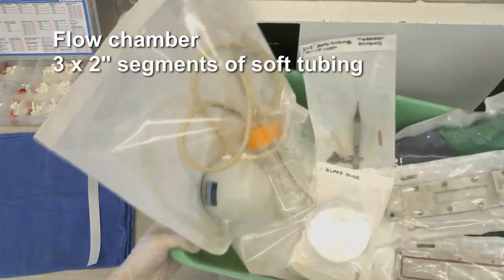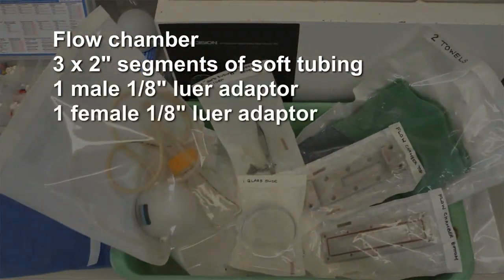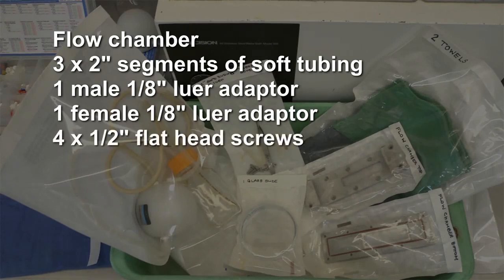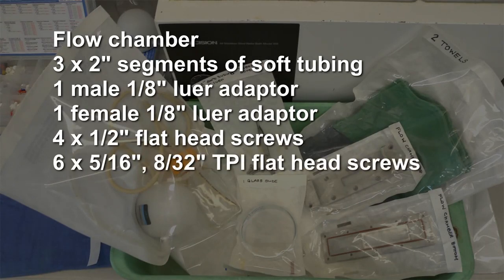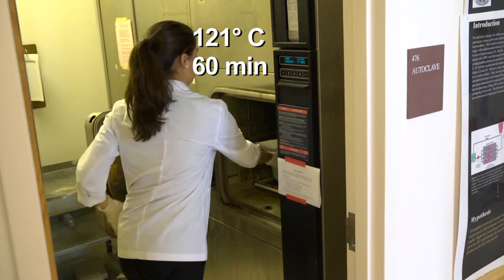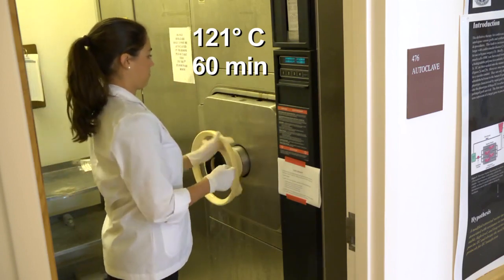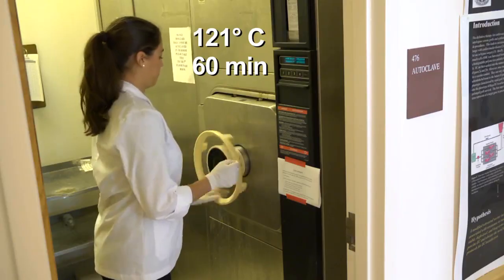1 complete flow chamber, 3 by 2-inch segments of soft tubing, 1 male and 1 female 1/8-inch luer adapter, 4 1/2-inch flathead screws, 6 5/16-inch 8/32 threads per inch flathead screws, 1 pair of tweezers, 1 glass slide, and 2 towels. Sterilize by steam autoclaving at 121 degrees Celsius for 60 minutes.